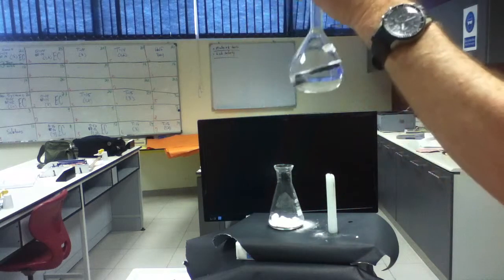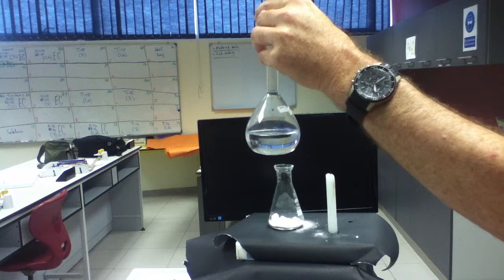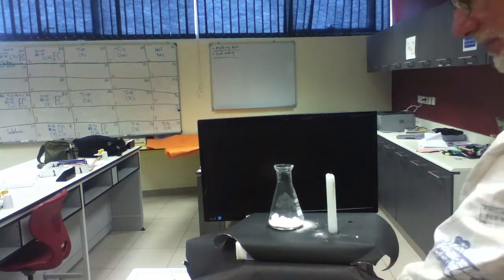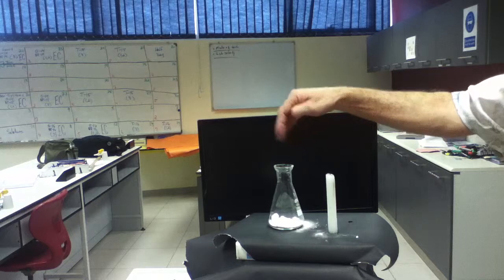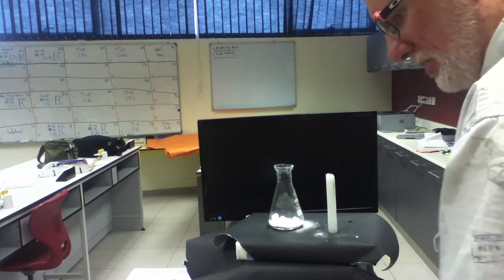This is 1/10 the acid in your stomach. So is it terribly dangerous? No, not even a little bit. Okay. So what I'm going to do is I'm going to produce some carbon dioxide, okay? So let me do that.